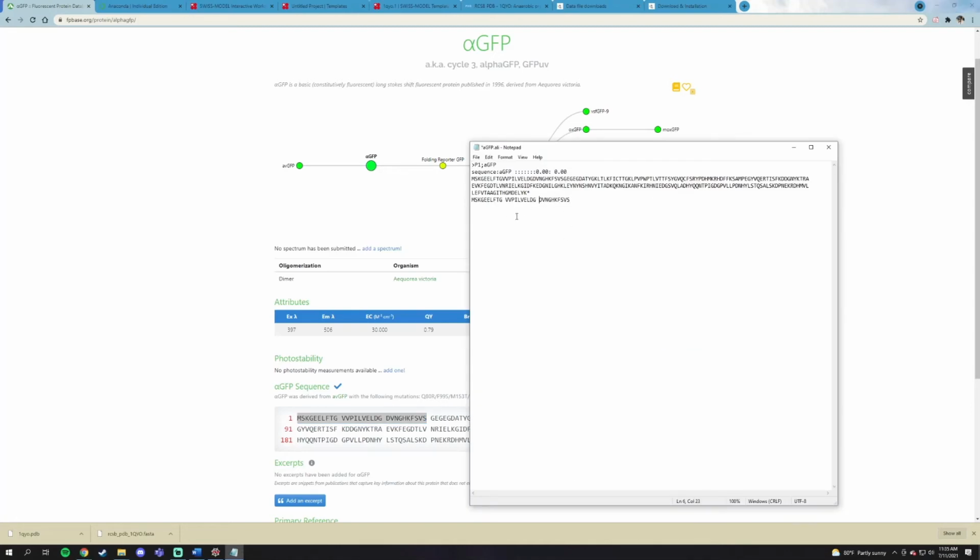Python doesn't like these spaces, so you need to remove them from the sequence, and after you remove all the spaces from the entire sequence, it will look like this. Having code on different lines doesn't matter because Python will just wrap to the next line if it's reading through it, but spaces count as a character that Python does not recognize. So you'll want to make sure to remove all the spaces from your .ali profile, or you will get an error whenever you try the next step.